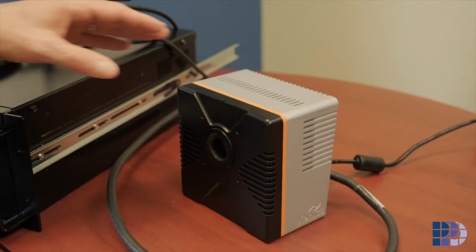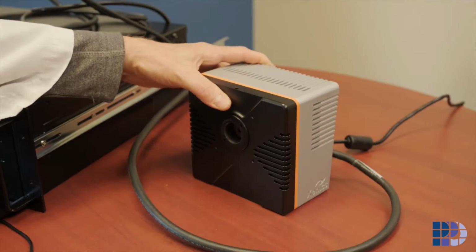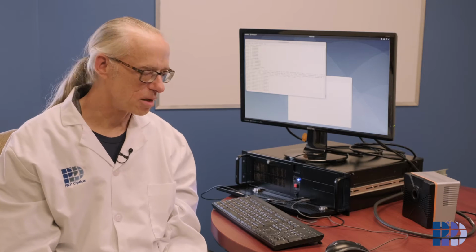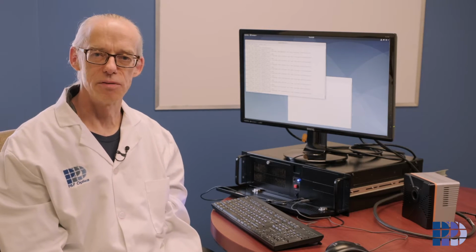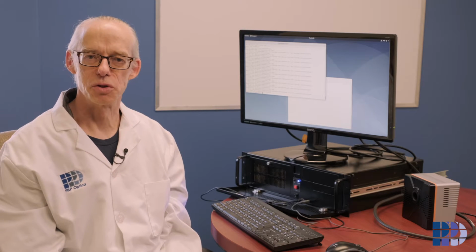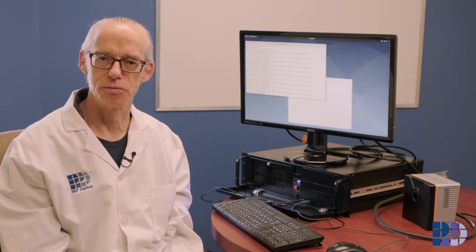Hi, I'm Alan. I'm a software developer here at PPO, specializing in industrial cameras, frame grabbers, and the camera interface to our software and in the system. The cameras, when we get them, they're pretty expensive near-infrared cameras, and they're idiosyncratic, so they need some testing and checking when they first arrive. And I do some sanity checks on them before passing them over to the optics group to make sure that they're ready to run our protocols and work in our machines with all their functionality.